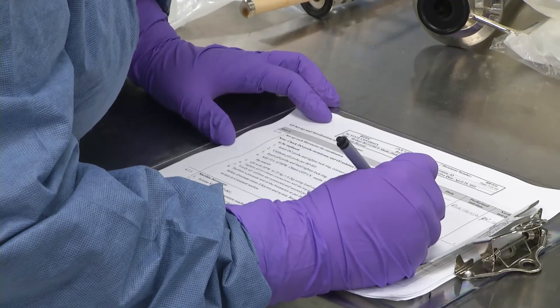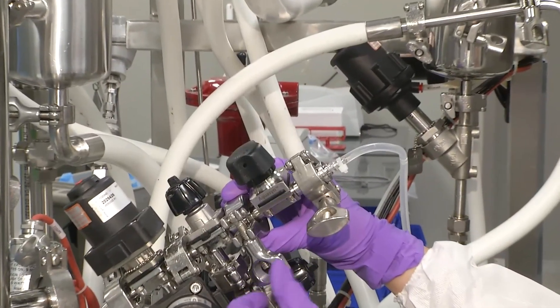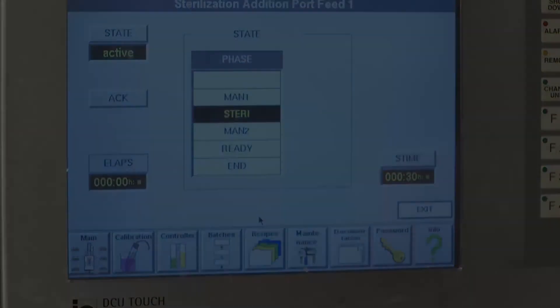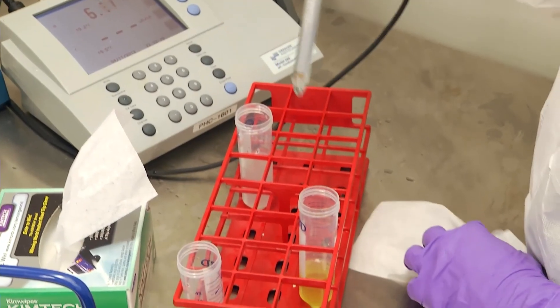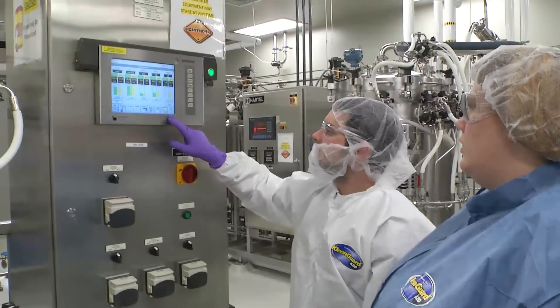Both the vessel and the media are now sterile and we're ready to add the final ingredients. The glucose hose is attached to the vessel, the connection is steamed to sterilize it, and the separately sterilized glucose antibiotic solution is pumped into the vessel. A manual pH reading of the media is then taken and the bioreactor is set up for its fermentation cycle.